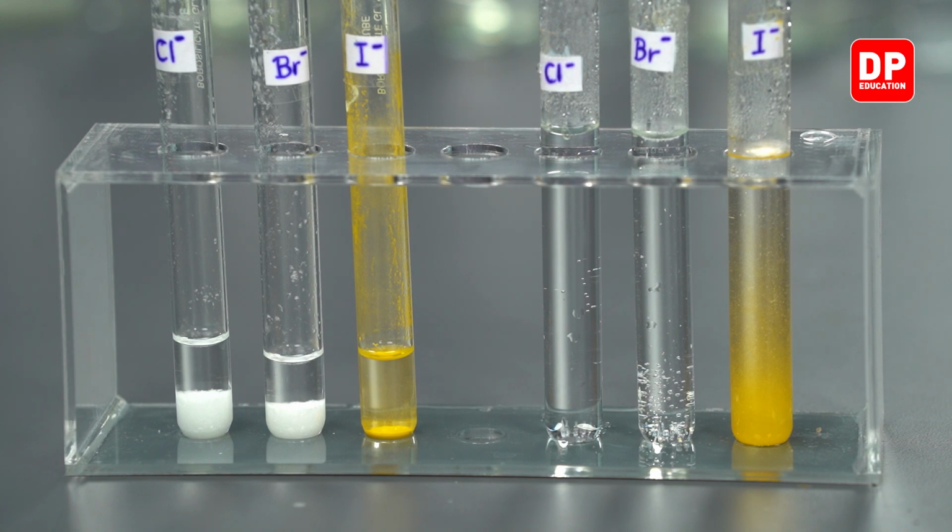Now, as it cools down, you can very clearly see a yellow color lead iodide precipitate forming again. Lead bromide and lead chloride are somewhat slower in forming precipitates, but as time passes, those two will also form a white color precipitate.